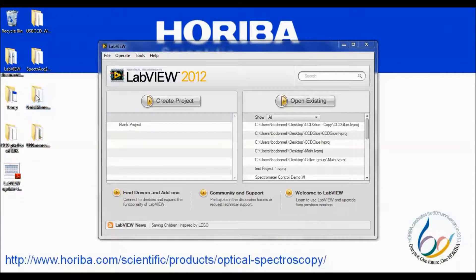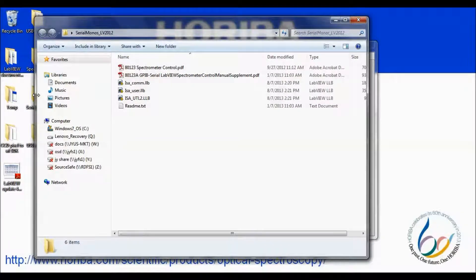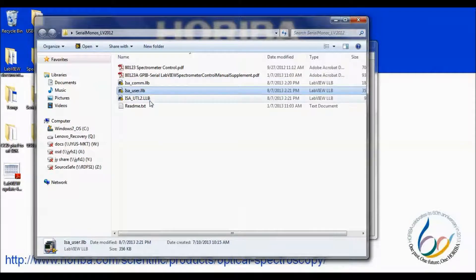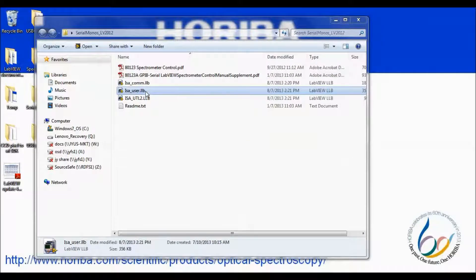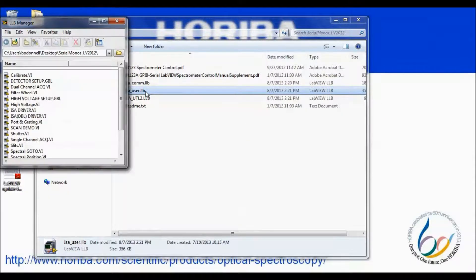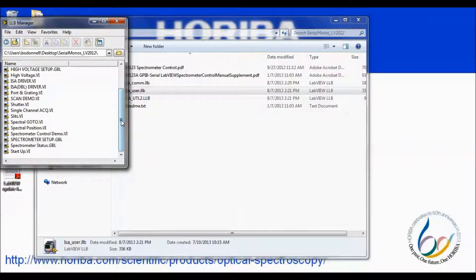The serial spectrometer libraries are organized in a similar manner to the USB spectrometer libraries. The two libraries labeled as COM and UTIL2 are low-level libraries for controlling the serial port or GPIB communications. The library labeled as user contains all of the sub-VIs required to control the spectrometer. In this case, the spectrometer parameters are set in the global file entitled Spectrometer Setup. Details on the parameter settings for various spectrometers are addressed in the manual for reference.